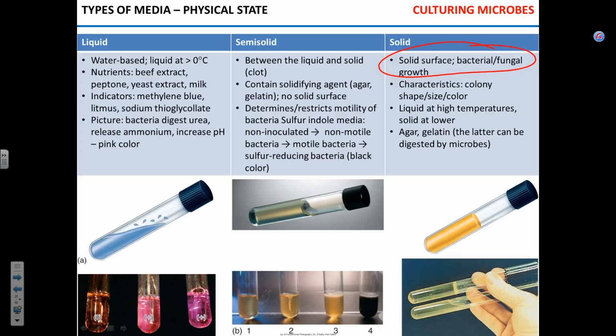You can see the example of the solid medium here, but nobody uses it in this form, honestly. I mean, what's the point to put agar in the tube? Come on. Everybody puts it on the plate. So the microbes grow on the surface, form colonies. That's a very important identification feature.